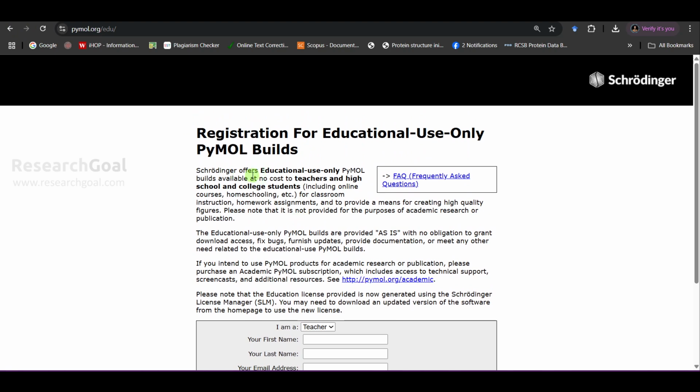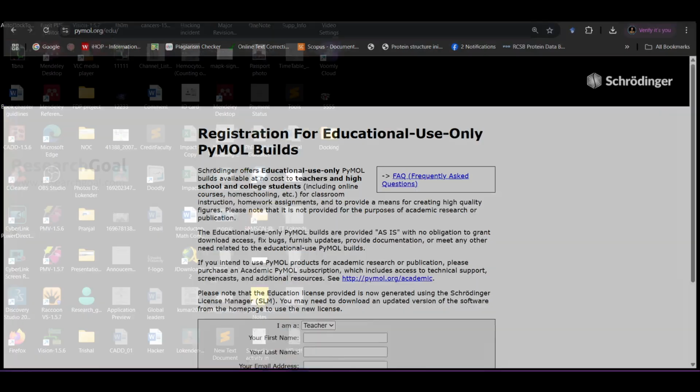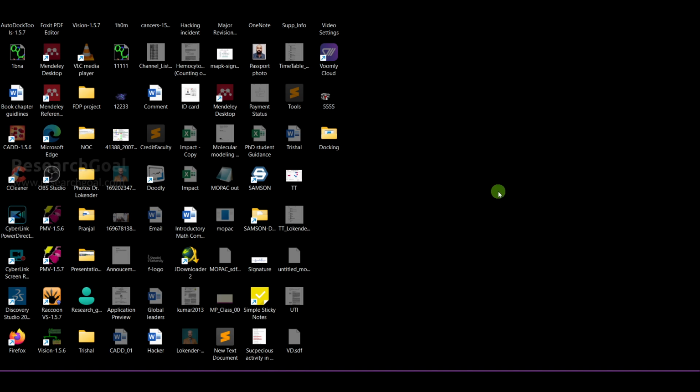And this is really powerful. This is a really useful tool, and I recommend everyone to download and use it. Take the courses that I've created. I've created 2 courses, and I'm also planning to create more courses so that you have a better understanding of PyMol and how you can effectively use PyMol and get publication quality images and good research out by using PyMol. So this is how you can download the tool, and I'm going to close this one and show you what PyMol basically looks like.